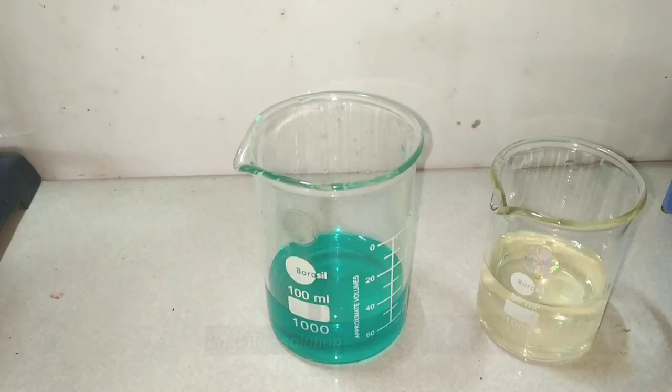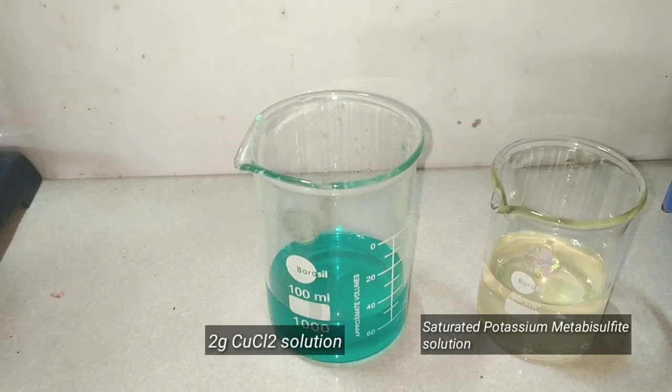Next, we move on to the preparation of copper 1 chloride. For this, we need 2 grams of previously made copper 2 chloride and some saturated potassium metabisulfite solution.